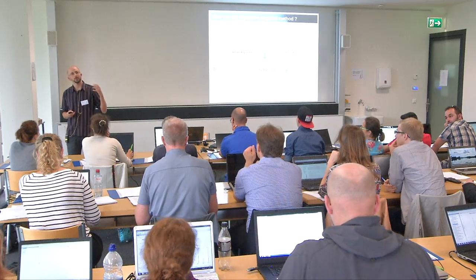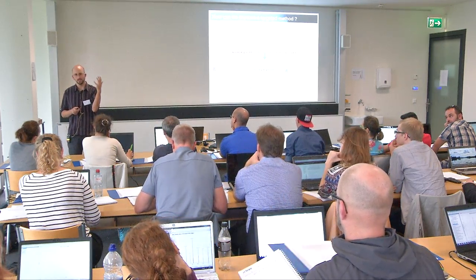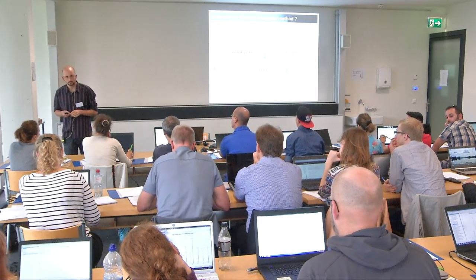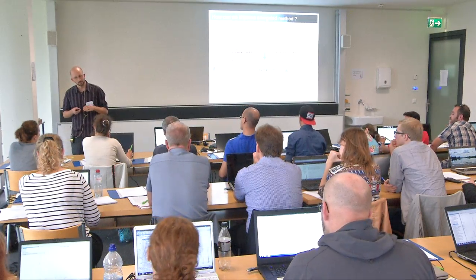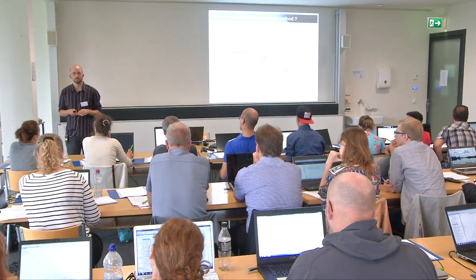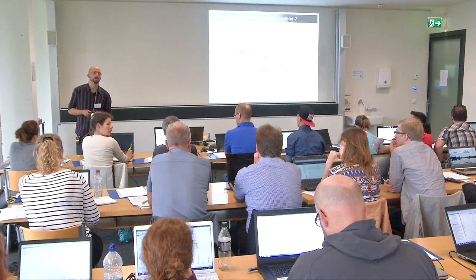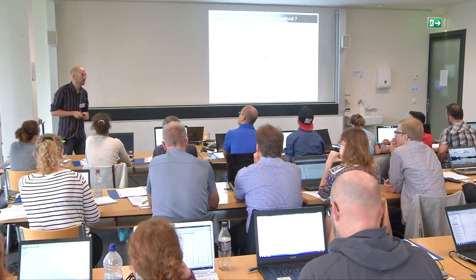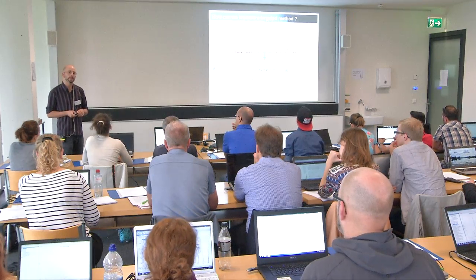So in Panorama, what you can do is export your Skyline documents, and then you can visualize and see other people's. Yes, that would be one of them. As far as I know, the dwell time is not stored in Panorama.